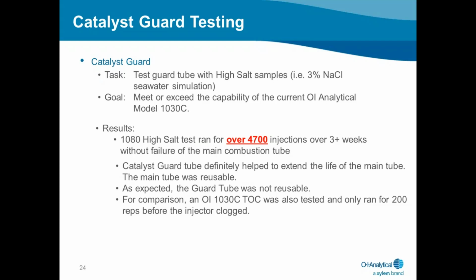For those of you who might be familiar with the OI Model 1030C Combustion TOC and the combustion tube previously shown, that combustion tube clogged after 200 injections in the same conditions.